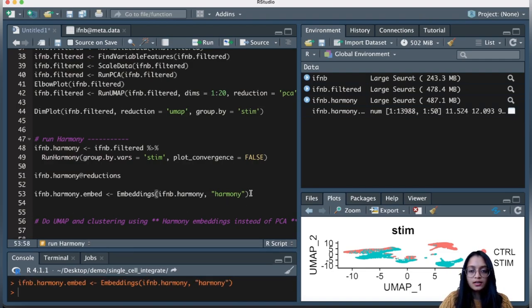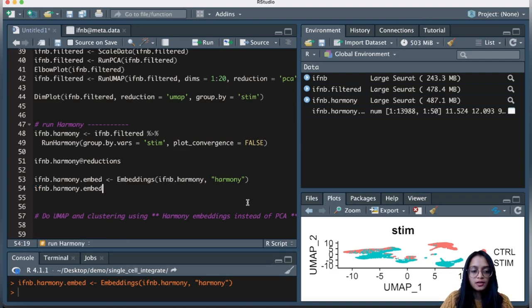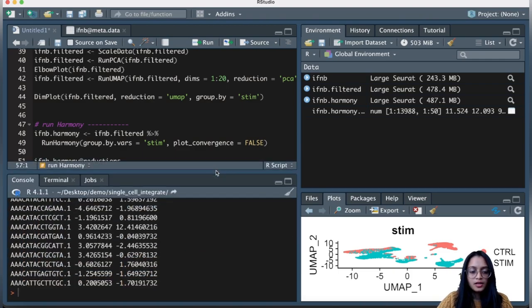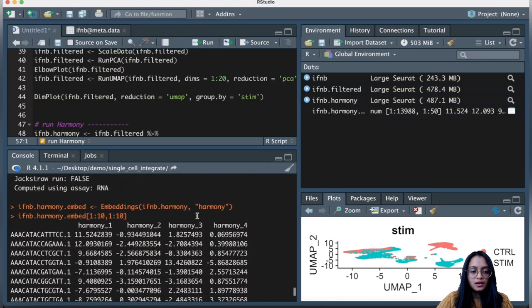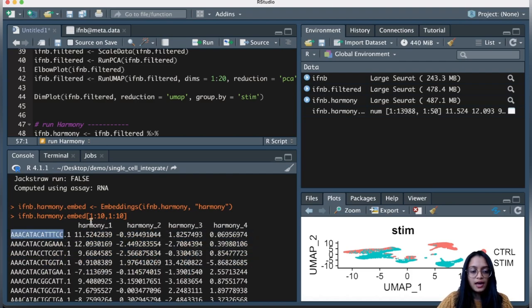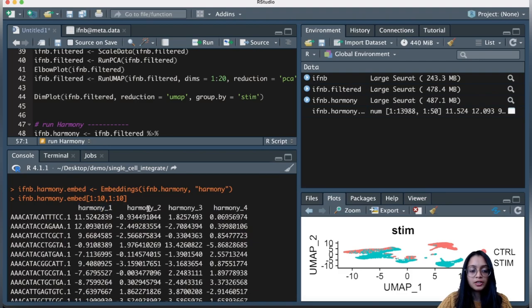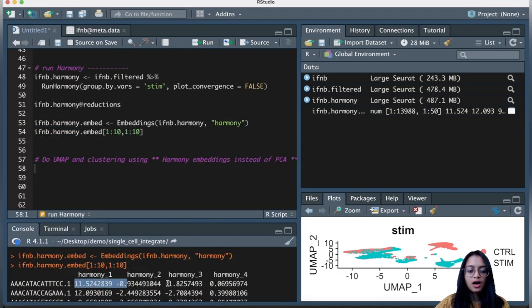Taking a look at the harmony embeddings object, we can see harmony embedding values for each cell. Just like we have multiple principal components, we have multiple harmony components. Using these harmony embedding values, we will perform non-linear dimensionality reduction — UMAP — and downstream analysis like clustering.